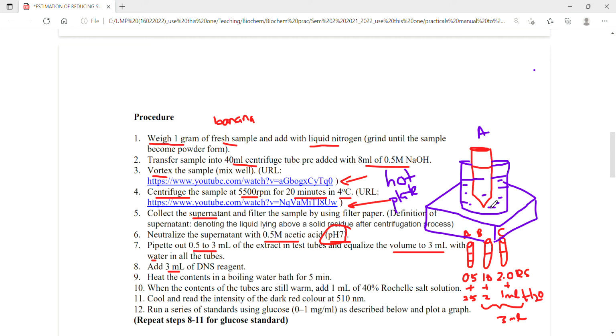Okay, and it has a mechanism of adjusting knobs. Just adjust the heat, maybe at 5 or 6, and then heat will start to come. And the water starts to boil, and it will transfer the heat to the test tube, and this is done for 5 minutes.